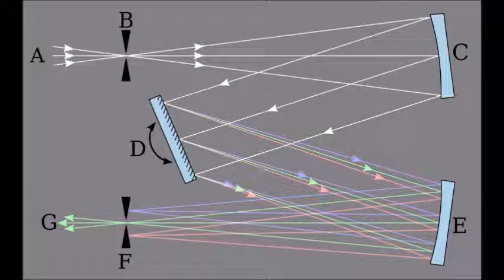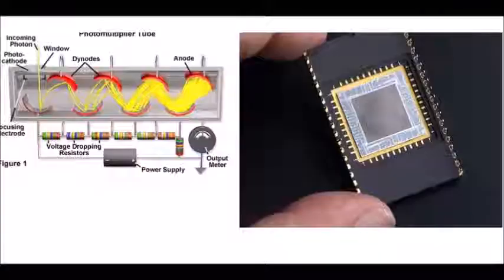Notice that most electromagnetic radiation is not visible to the eye, just a very small range of the visible region, so we don't usually see anything during spectroscopic analysis. The detector should be sensitive to the specific frequencies we are measuring. There are two common types of detectors. The charge-coupled device, or CCD, depends on photovoltaic cells, and it resembles your Android camera.